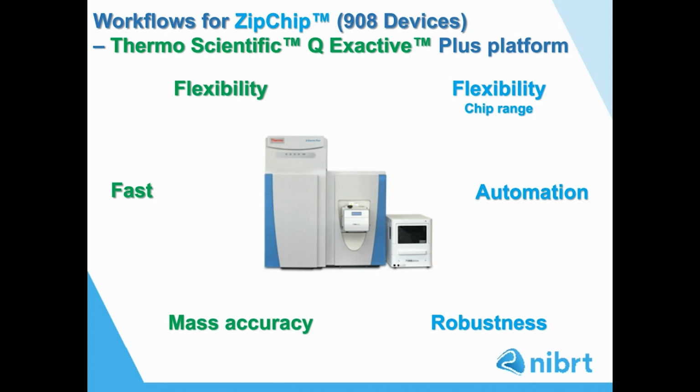Microchip CE analysis surely has the advantage of requiring low sample volumes, and this could also be important during drug development when sample availability is limited. As well, the platform allows quick switching between applications, so it's really flexible and requires minimal method optimization.